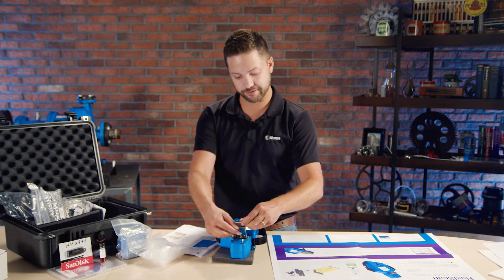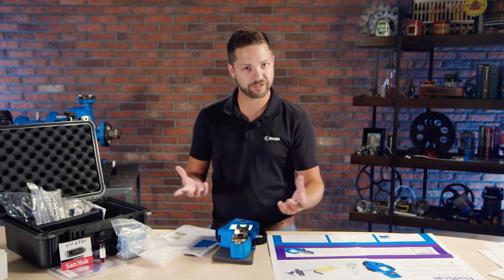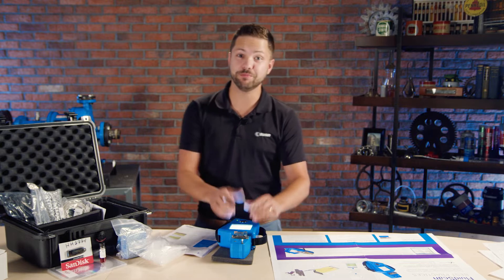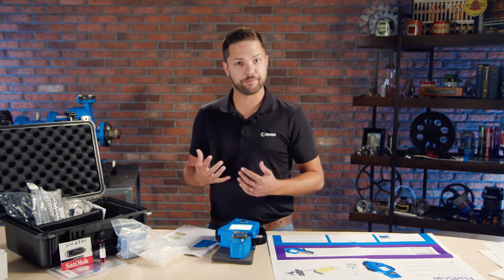There's a little flip-top that you open up and drop oil into — I'll demonstrate it in a minute. Once you put it in, it takes about one to two minutes to run the analysis and gives you all these parameters.